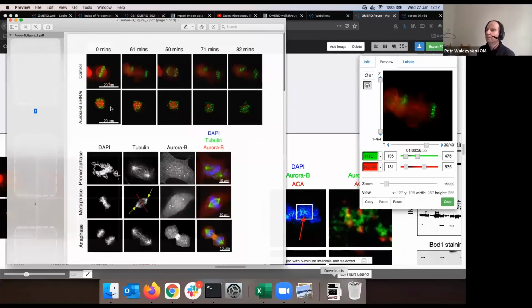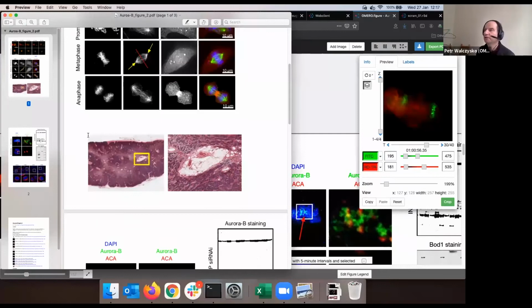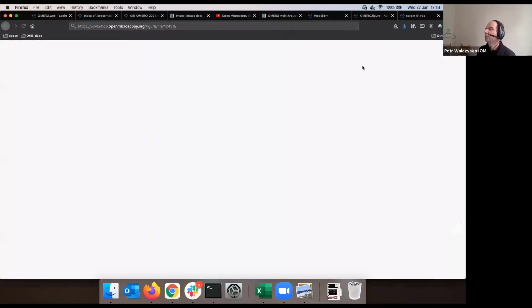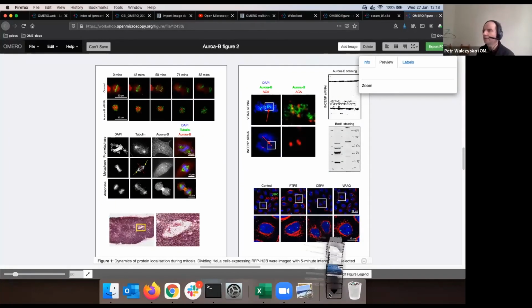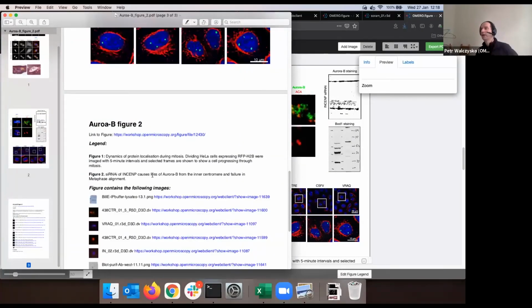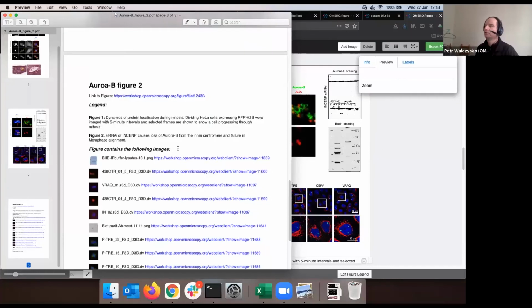It has 2 pages, but my PDF has 3 pages. Why is that? Well, because some metadata of the figure are here. So first of all, link to the figure itself is here. So if I click on that and I'm logged into Omero, the figure will appear immediately for me. So 2 things, I had to be logged into Omero and I had to have a right to see the figure. By right, I mean within the Omero permissions system, okay? And you can send such link to your colleagues as well inside email. That's also quite useful. You can grab that link actually from the URL.